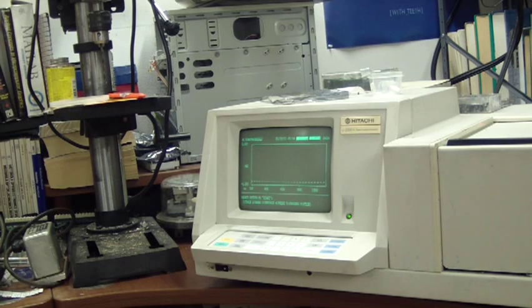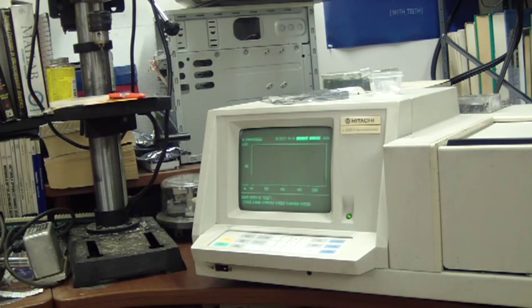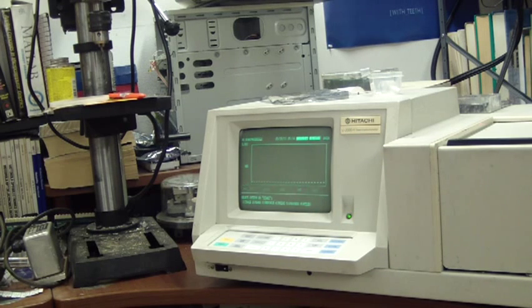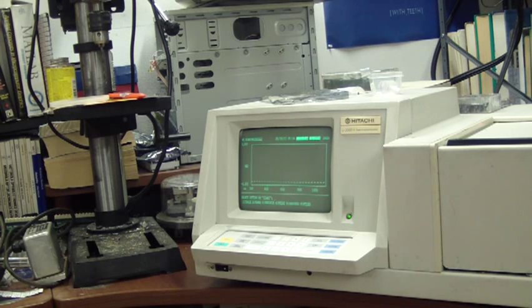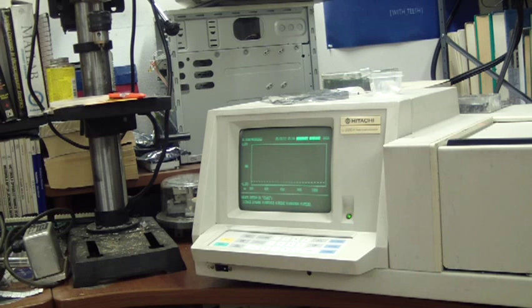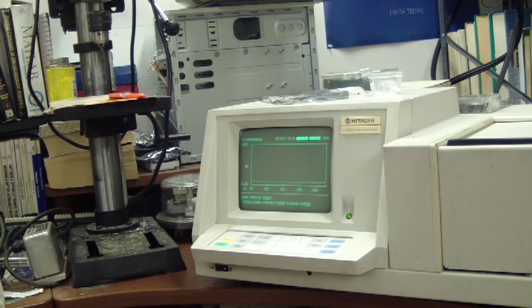Here is a Hitachi U2000 spectrophotometer. This particular method is calibrated and baselined for materials analysis, that is solid materials.